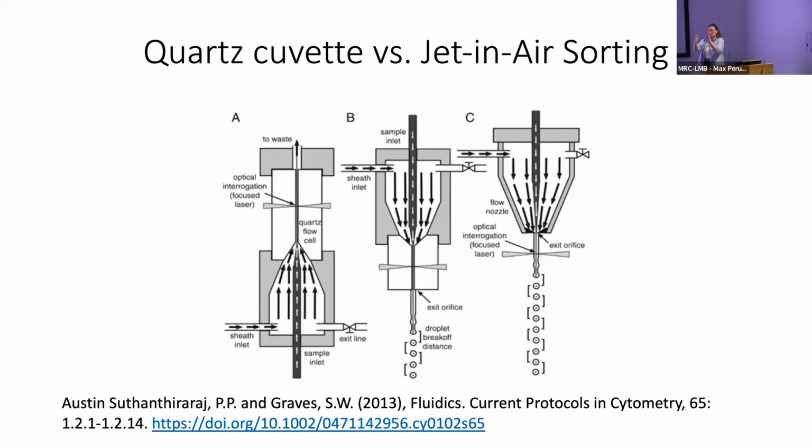If the particle is charged positive or negatively, it will then be sorted off to the right or left. We can sort up to 6 different populations in modern day sorters. So they will have a full positive or negative charge, or a half positive or negative charge, or a quarter positive or negative charge. And that's how we sort cells.